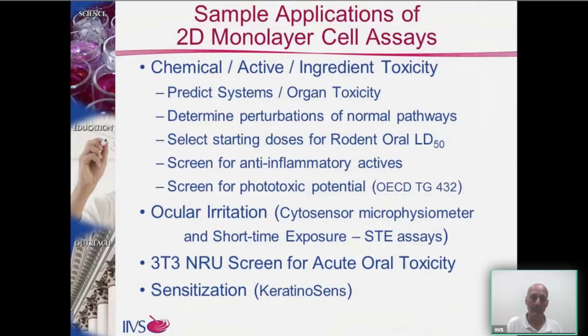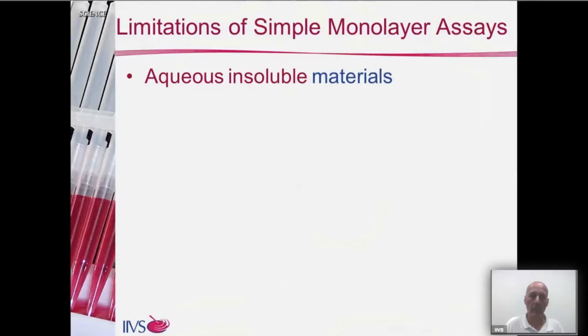And lastly, Dr. Tanashi Ruano will cover the application of a keratinocyte assay, a reporter cell, that allows you to detect the potential for those chemicals that are typically chemically reactive and likely to be skin allergens. So these simple monolayer assays do have some limitations, the first of which is that aqueous insoluble materials are challenging to utilize in these test methods since the materials are diluted in the aqueous media. This is a particular issue that has to be evaluated before testing and is a concept that Alison Hilberer will cover in the application for the phototoxicity assay.